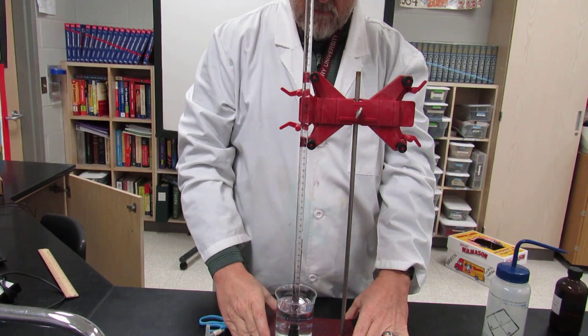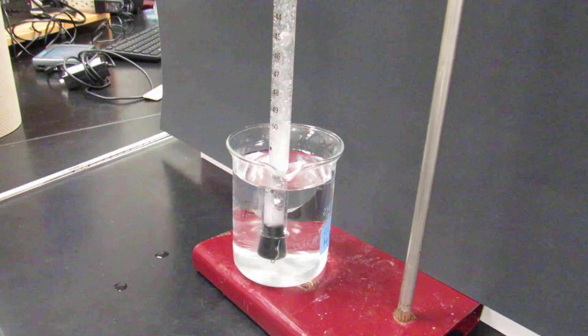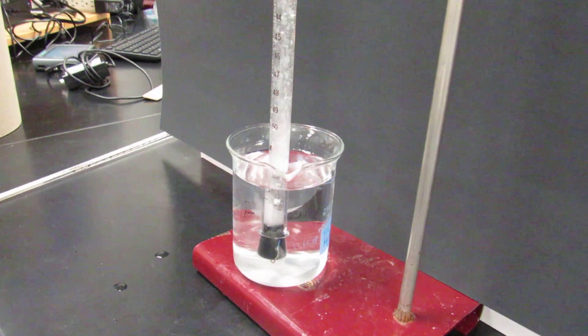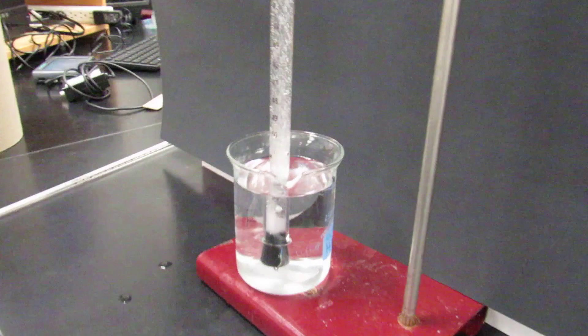The hydrochloric acid is more dense, so now that it's flipped over it will start coming down and reacting with the magnesium. You'll see a fizzing going on when that happens. That fizz is the hydrogen gas being collected in the tube.